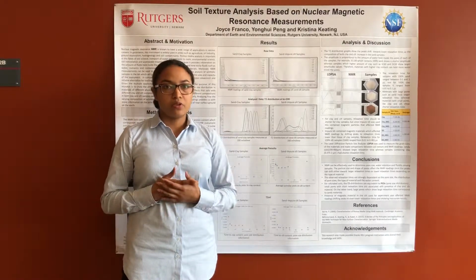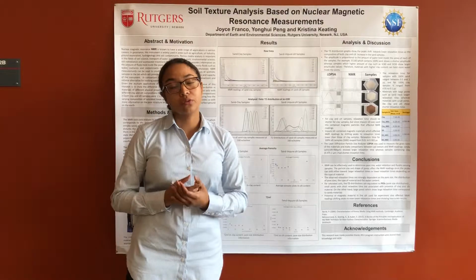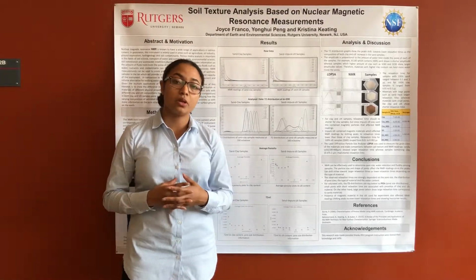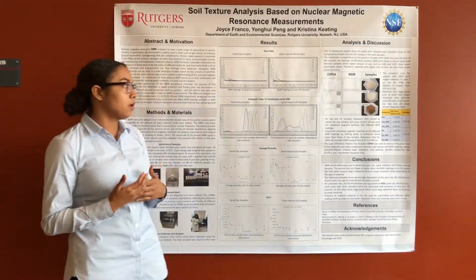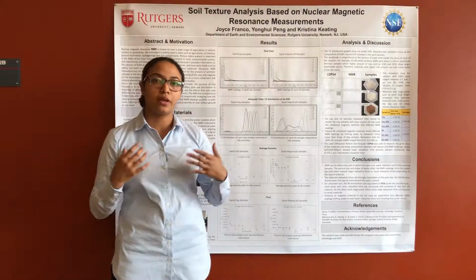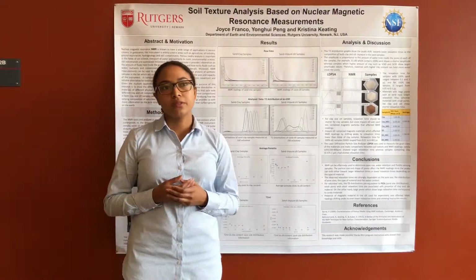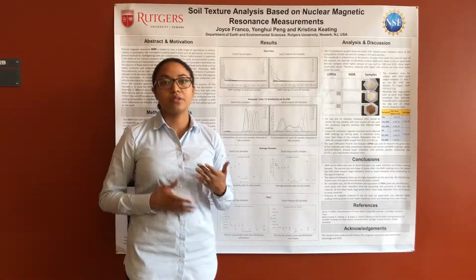The major conclusion of my research is that the NMR rock core analyzer can be used to estimate the water retention inside the pores and the pore size distribution. But this instrument also has limitations, like when it comes to analyzing materials that contain magnetic materials, this may affect NMR readings, leading to inaccurate results. So this is the reason why further research needs to be done.